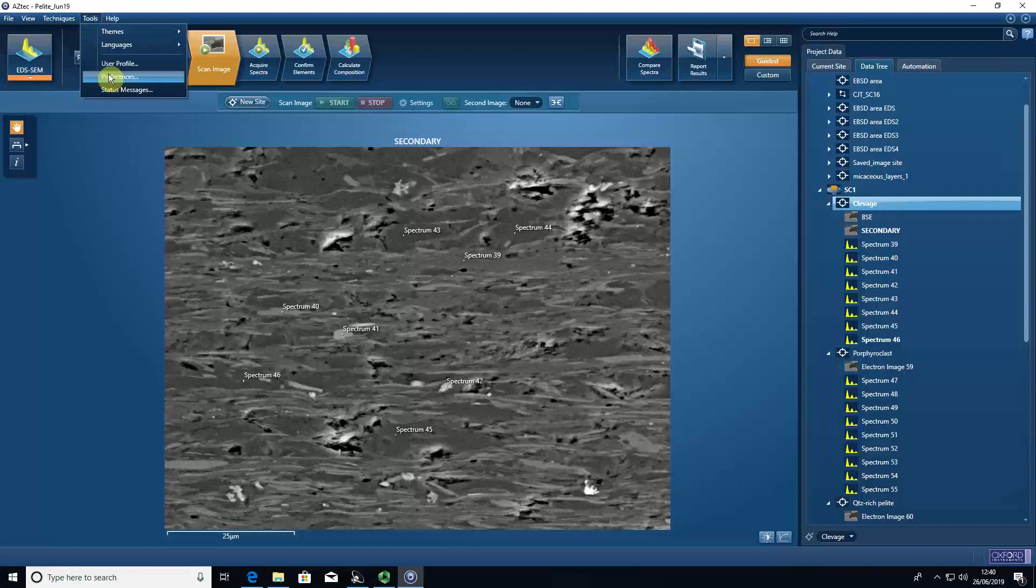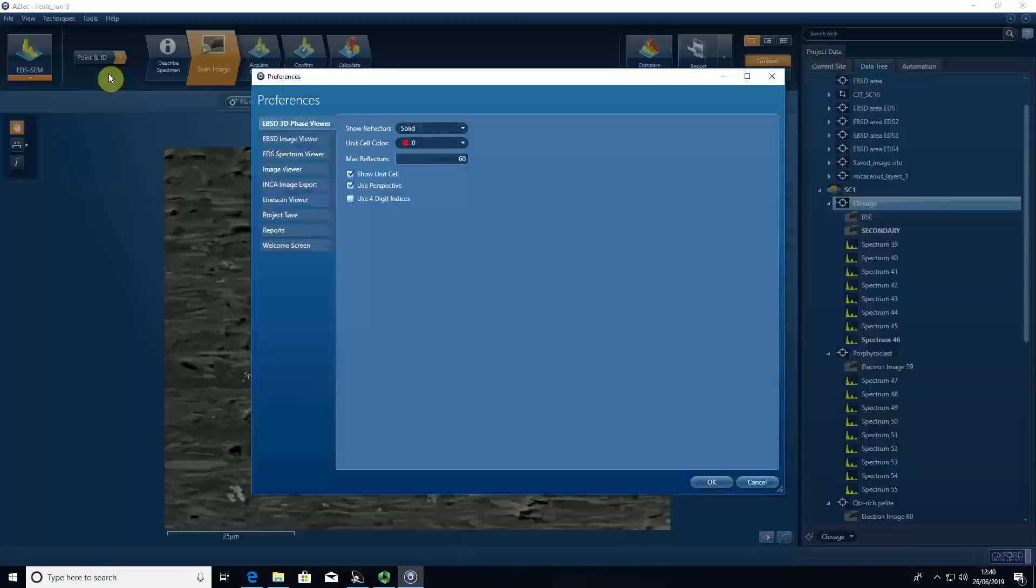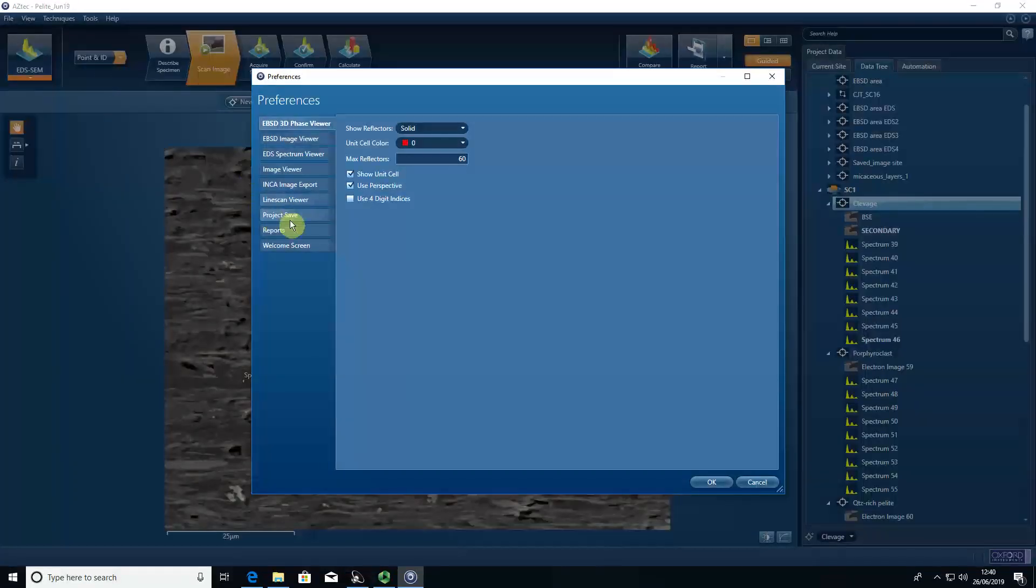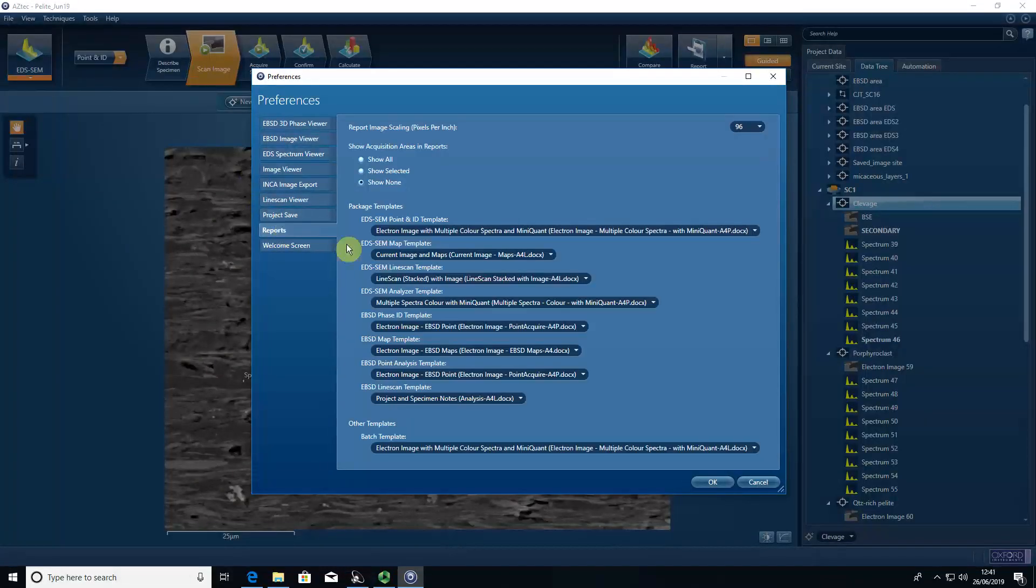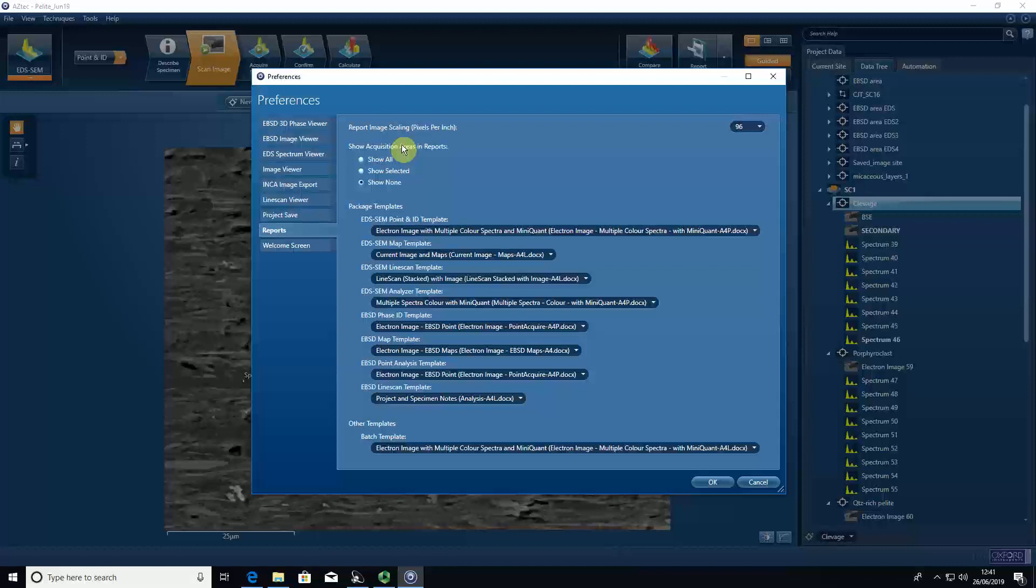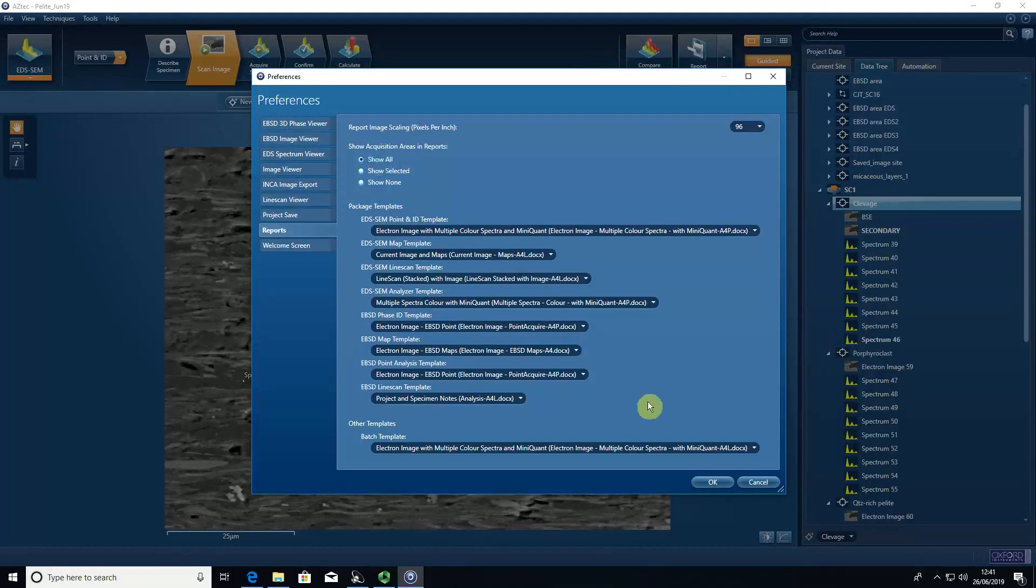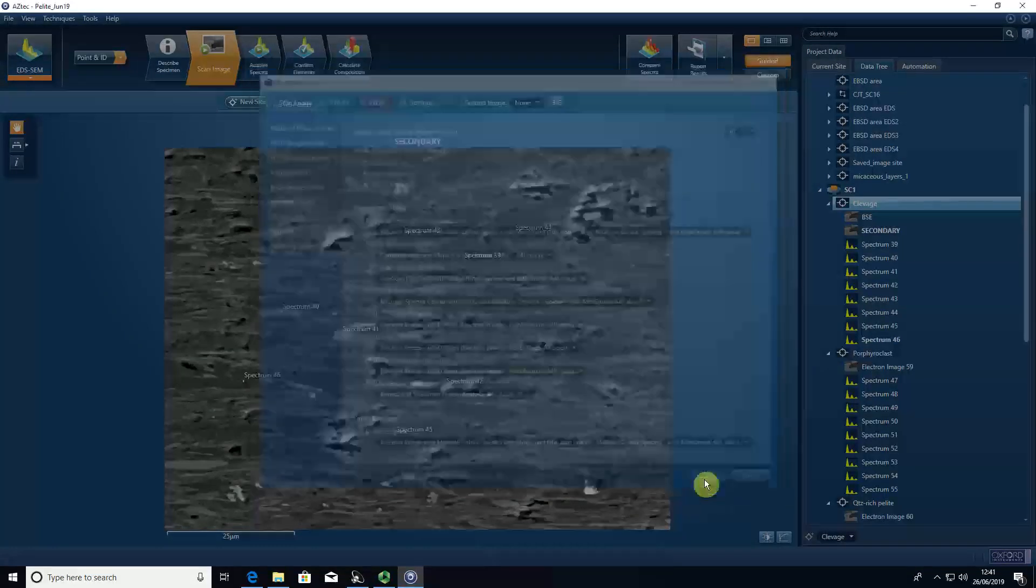So we go to tools, preferences, reports, show acquisition areas. We want to show all in reports. Say OK.